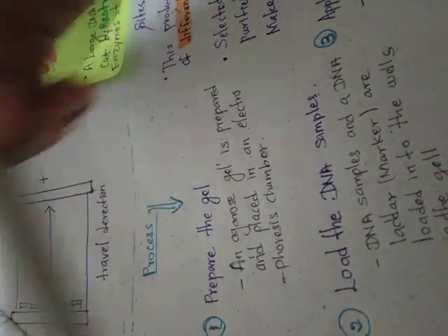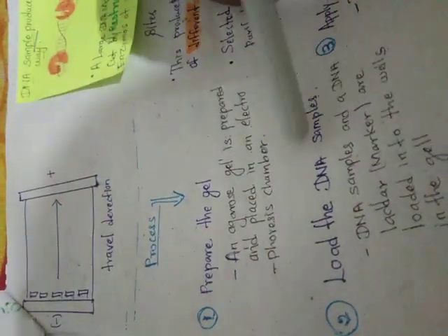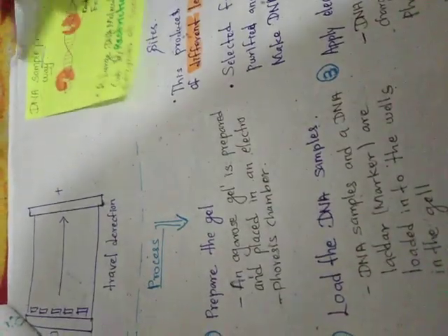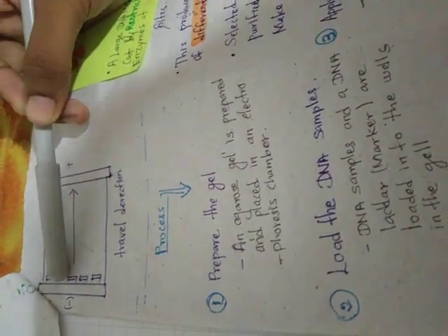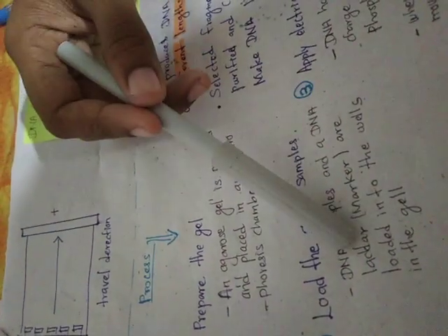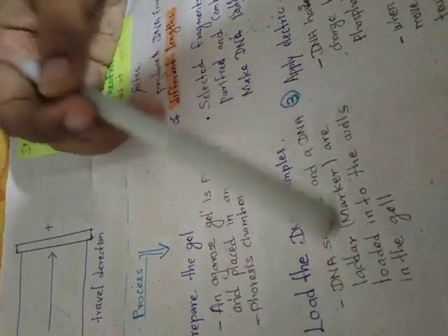Then the second process. What is the second process? Load the DNA samples. We have already made the DNA samples. So we have to load the DNA samples into the wells. DNA samples and DNA ladders are loaded into the wells in the gel.